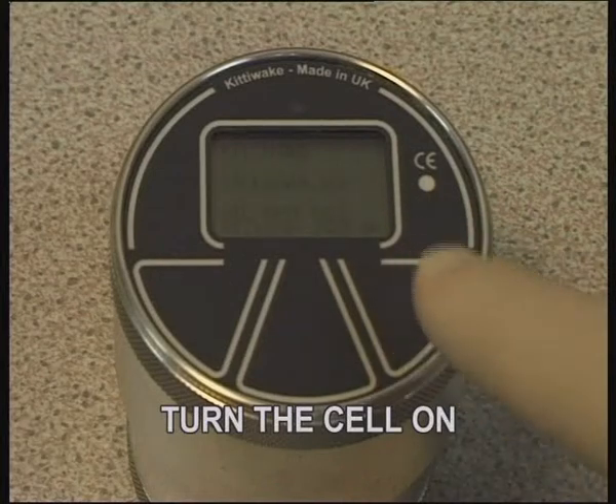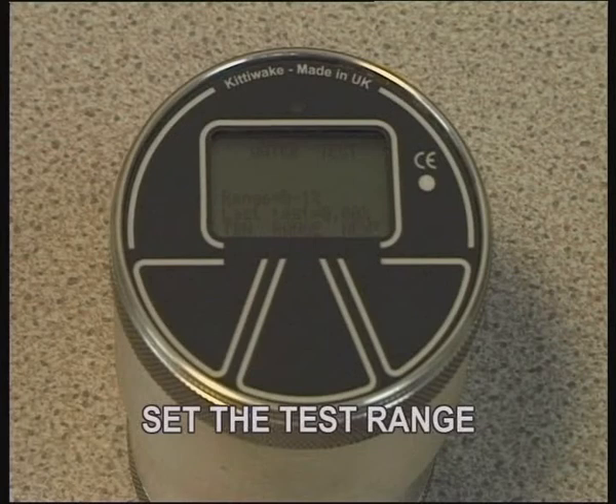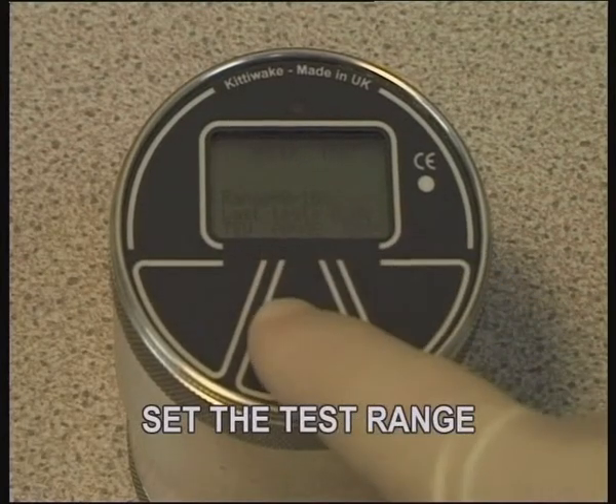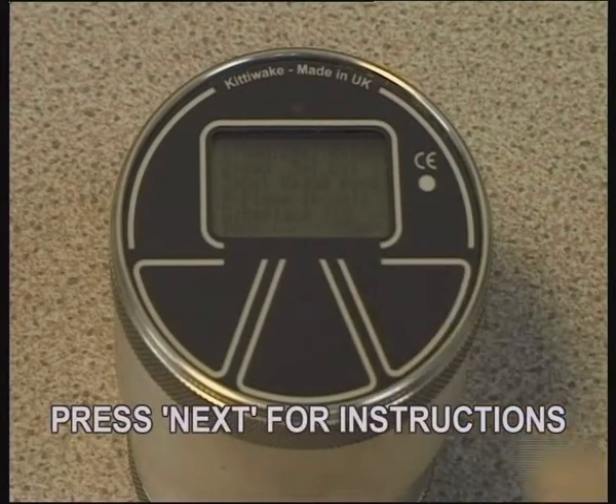Press the right hand touchpad to switch the cell on. Press range to select one of the three available ranges for the test. Press next to proceed with the test.